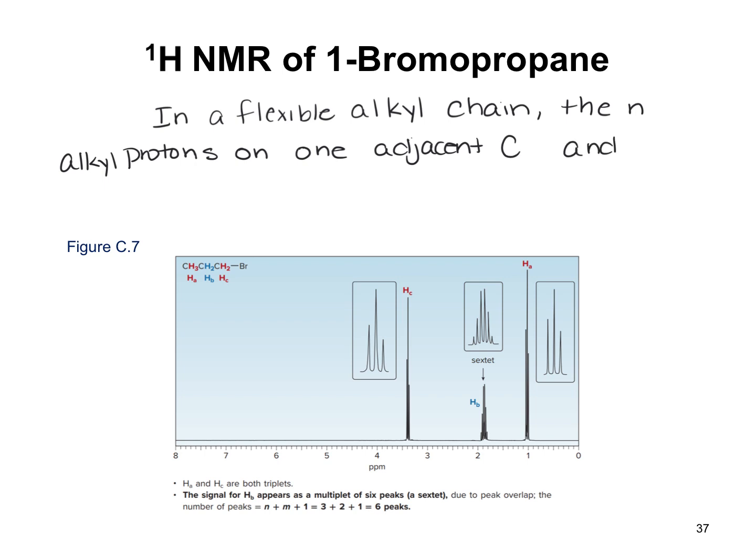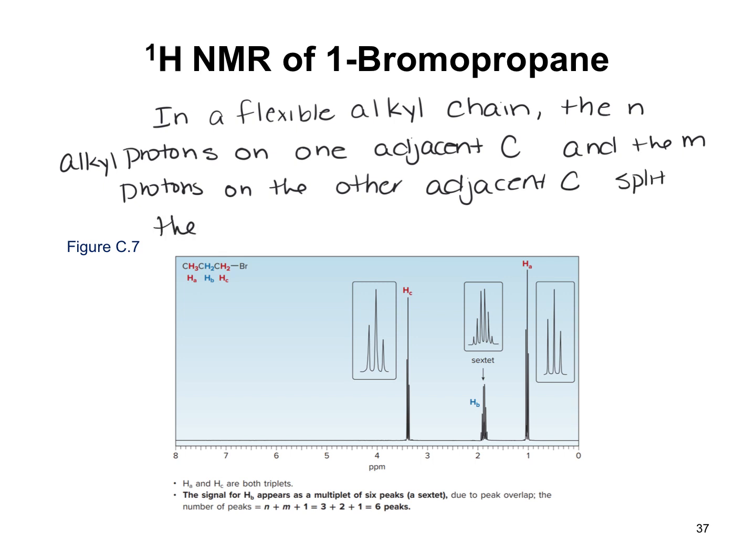And now we're going to introduce another variable, the M protons on the other adjacent carbon split the signal into M plus N plus 1.